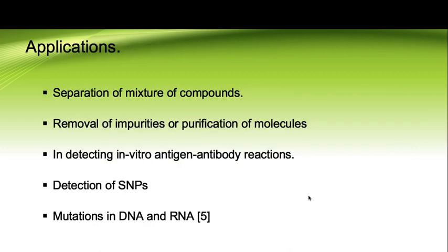Moving on to the applications of affinity chromatography, separation of mixture of components. It also removes impurities and also purifies molecules. It is involved in detecting in vitro antigen antibody reactions. It also detects single nucleotide polymorphisms. It also detects the mutations that are seen in DNA and RNA.